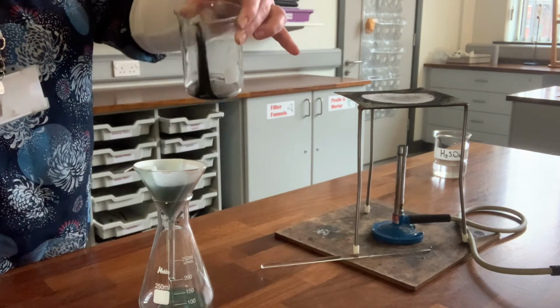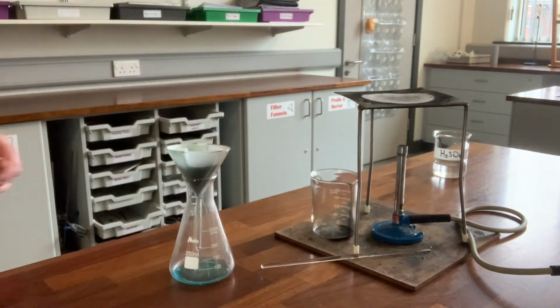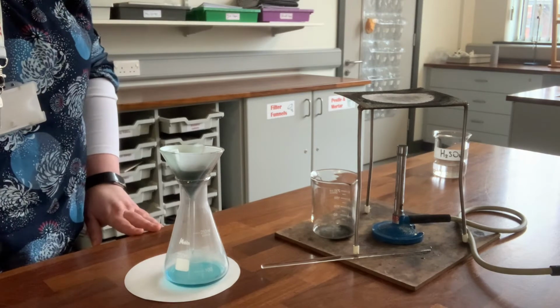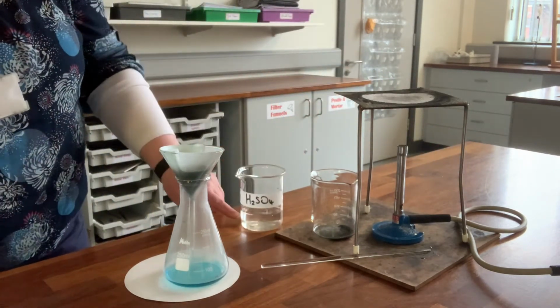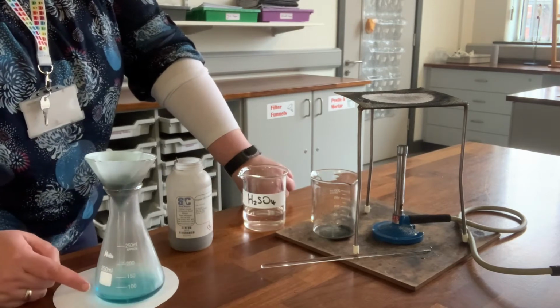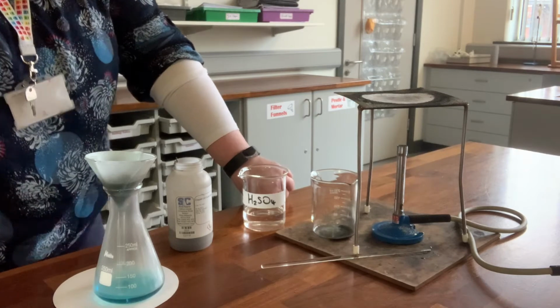So in a beaker we've got the copper oxide left that was in excess. And over here, if I get another piece of white paper to put underneath the flask, you will see the colour of the solution that's been produced. So you can see we're getting a blue solution formed at the bottom. So we started with the sulfuric acid, which was colourless. We added black copper oxide to it, and now we've got a blue solution, which is copper sulfate that's formed. So we've got copper sulfate plus water.